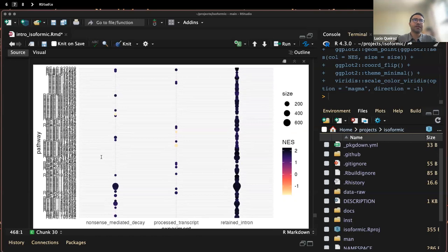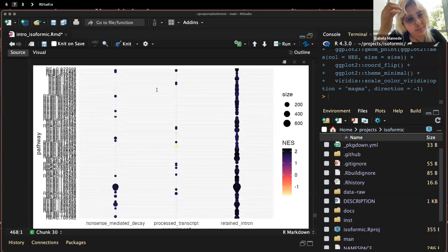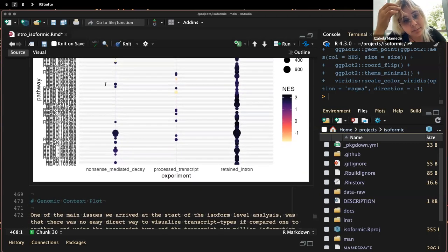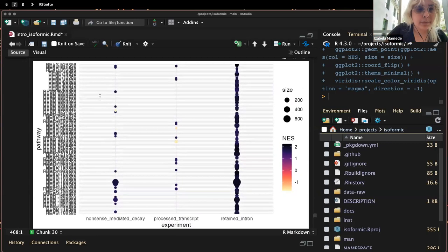Yeah, and this, again, if you are doing that analysis because you are studying a disease that you know nitric oxide is known to be affected in, and then if you look just at the gene level, you can find that it's being upregulated. But actually there is some biology that is also affecting that same pathway in the non-coding or the unproductive. Yeah, like one specific case, NOS2 doesn't appear in this data set at the gene level, but if you look at it on a transcript level, it appears and it upregulates the nitric oxide pathway.